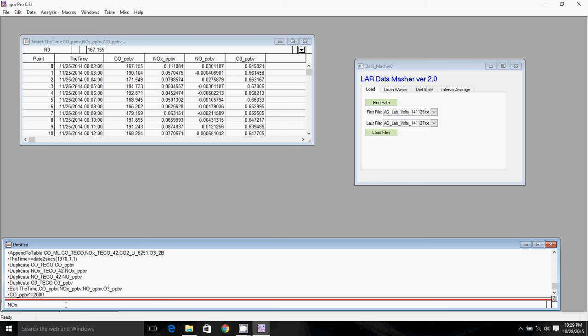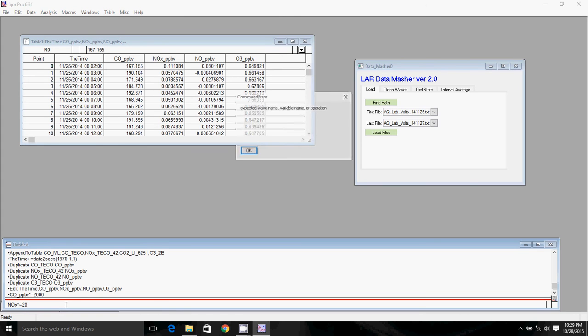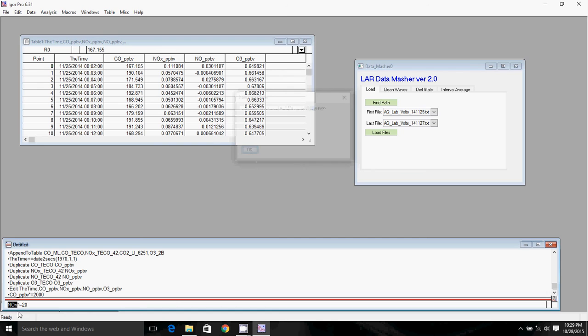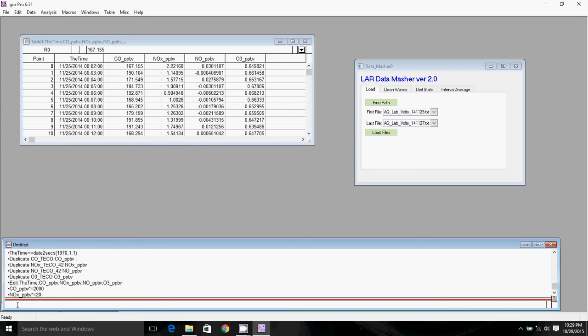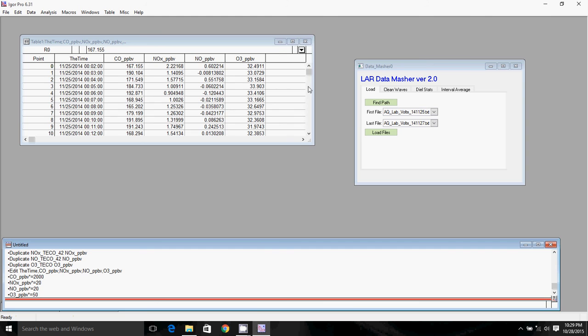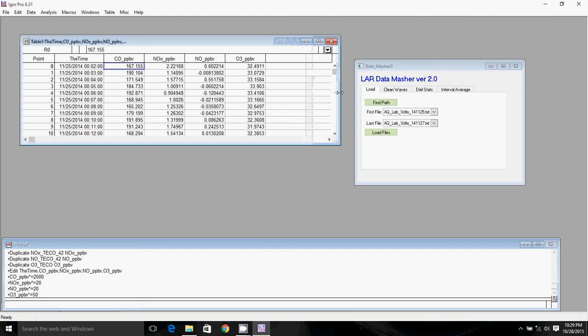The NOx response factor is 20 parts per billion per volt. We've got to write parts per billion there. The NO response factor is the same. And the ozone response factor is 50. Okay, so now we have all of our data in parts per billion.